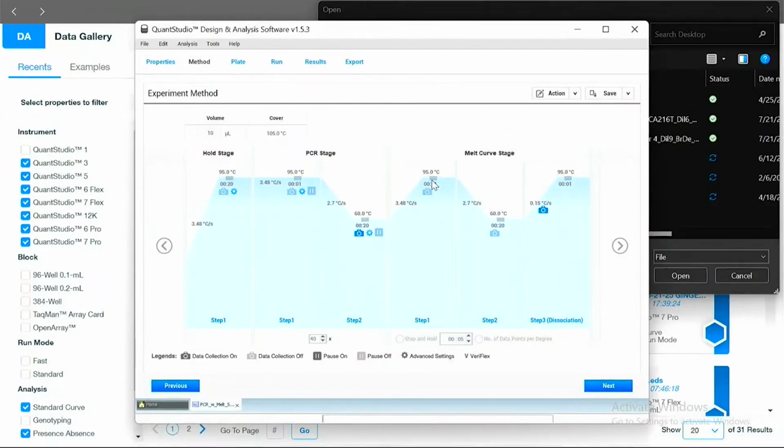But what we're going to do is finish our amplification, collect all that qPCR data, and then heat it up and cool it down. So we're going to denature everything until it's single-stranded, and then cool it to a temperature cooler than, or at least equal to, our extension temperature. Then we start increasing the temperature again to melt it apart slowly.